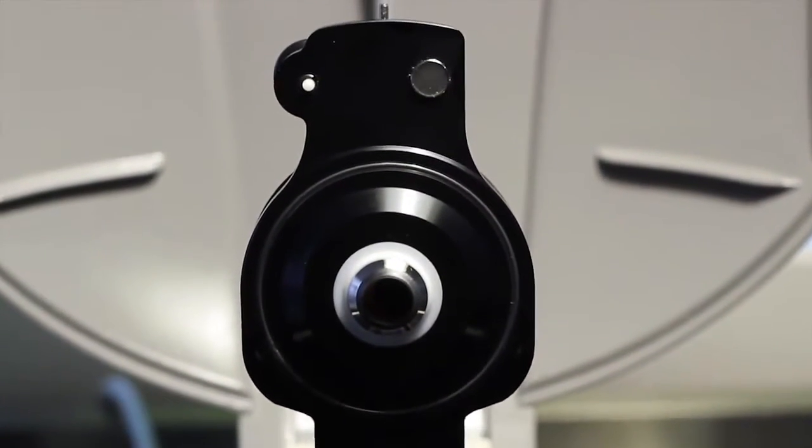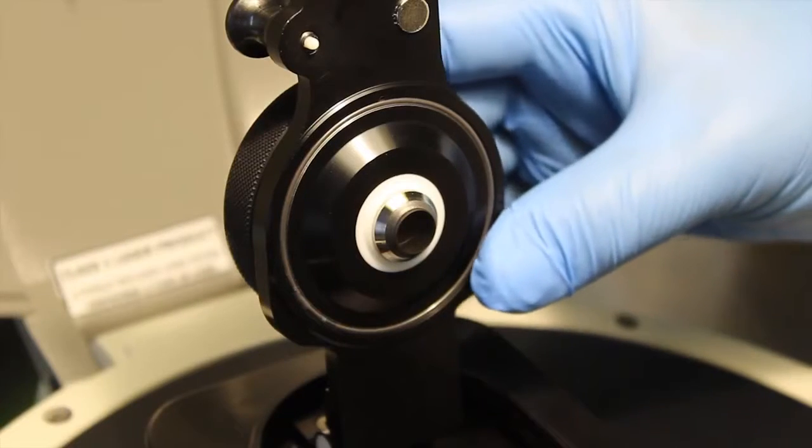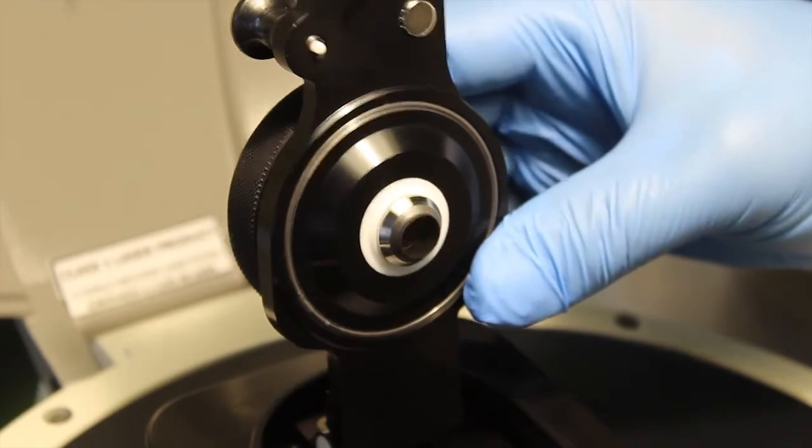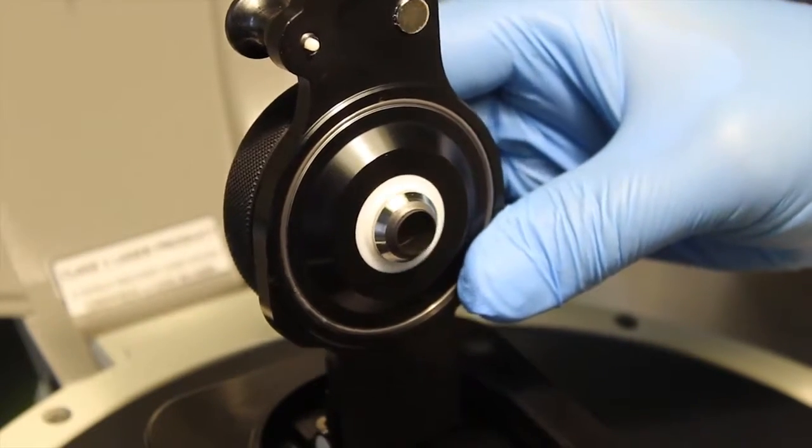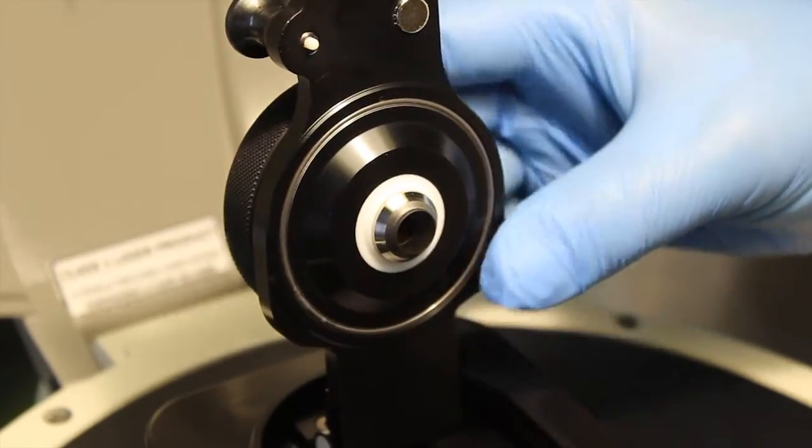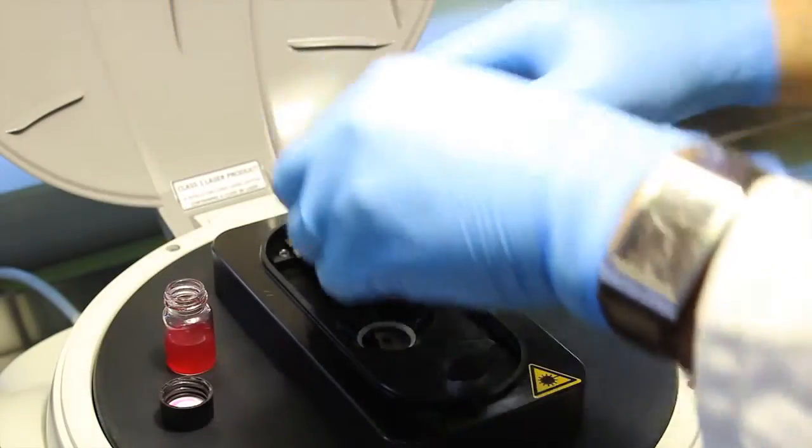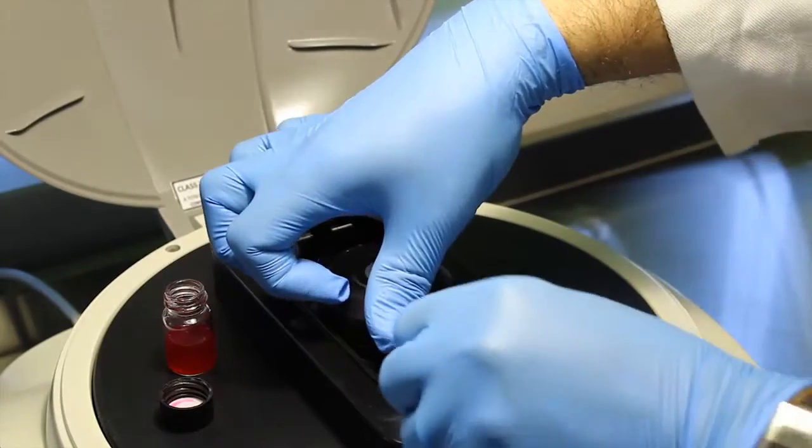Thanks to its unique and original concept of liquid thin film measurements with two preset thicknesses, Vasco allows to adapt the measurement configuration to the sample, and to prevent spurious signal and measurement artifacts such as multiple scattering and local heating.